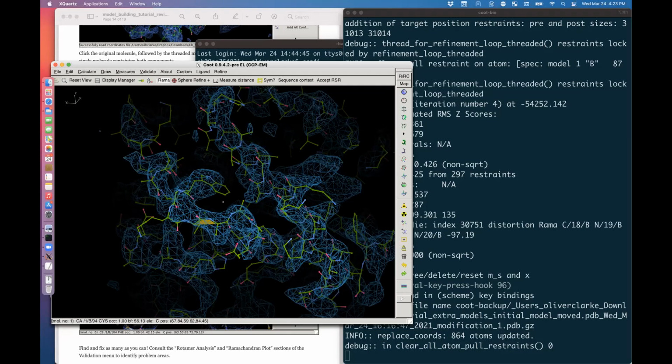So if I was getting a map that is 4 angstroms-ish, I might well decide that it'll be a quicker route to a model to collect more data or data on a slightly optimized sample to hopefully get better resolution than it would be just to try to build in. That would be my take on it. Does that answer the question? Okay.